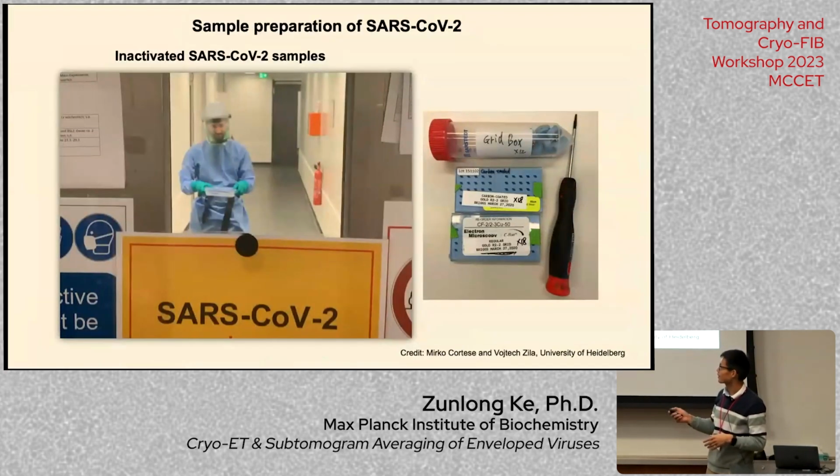So yeah, that's the collaborator in the biosafety level 3 lab in Heidelberg. We were shipping the tools and grid boxes and so on to them at the time, so that they could prepare samples and ship them back to Cambridge, UK.